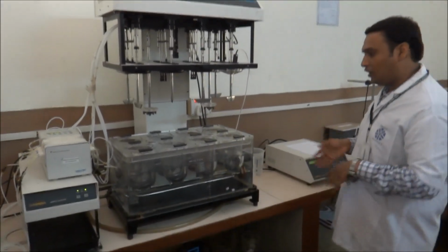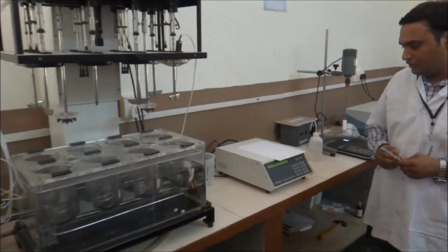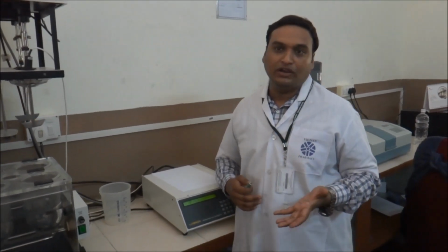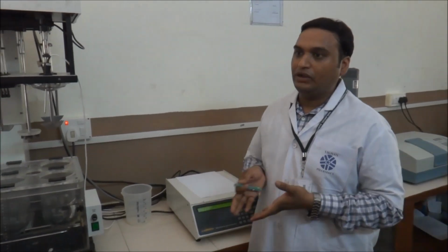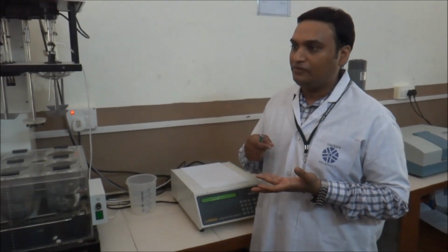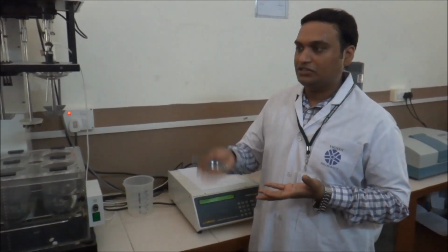Now coming back to the operation manuals and basic theory of dissolution. As we said, whenever you want to perform a dissolution study, obviously what we are going to do is input a program. So what is a program input? A program input is nothing but the number of variables that are involved in your dissolution study.